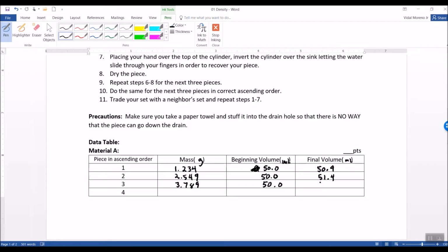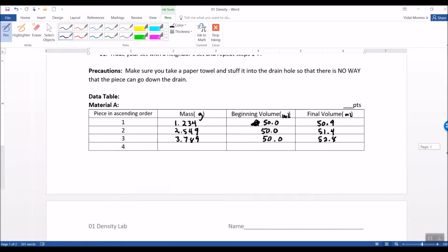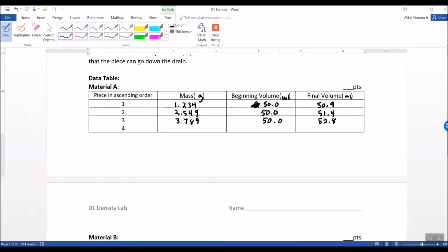So your data should look something like this. You're taking a guess with that tenths place. It's a total guess. Everyone's going to be a little different. You need to make sure that the same person is measuring all the time, or else you will not be precise. That's for you honors students.